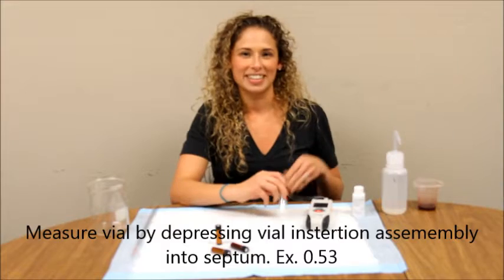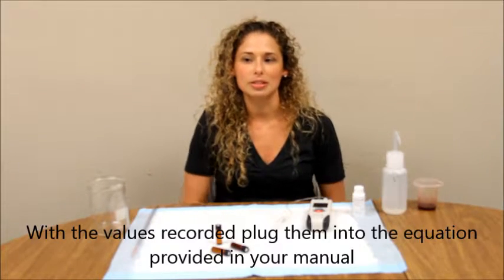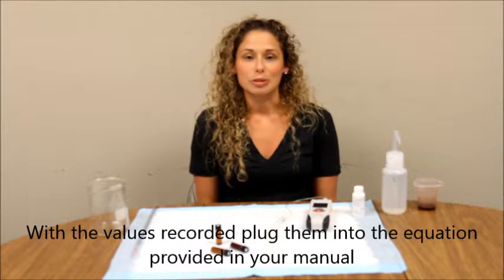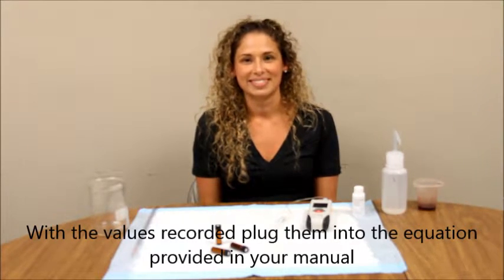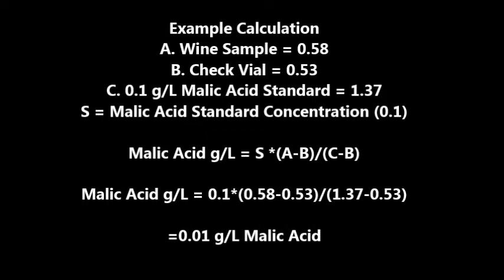With the values you just recorded, plug them into the equation in your manual to determine the malic acid concentration in your wine. Thank you.